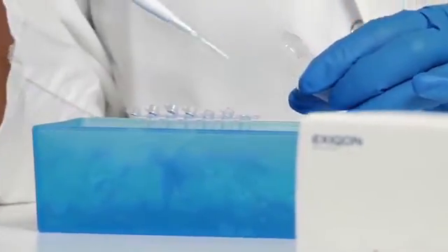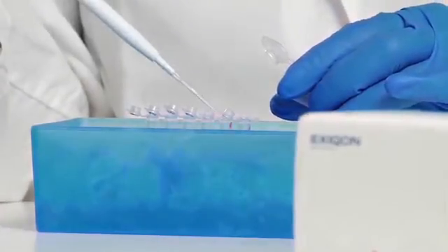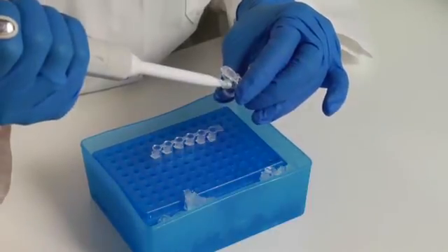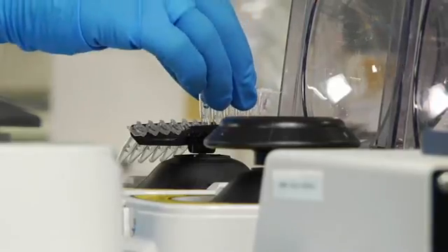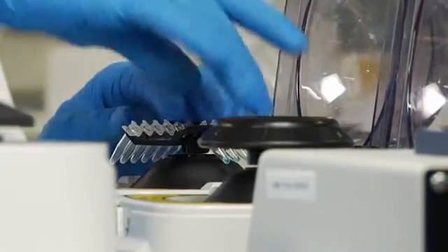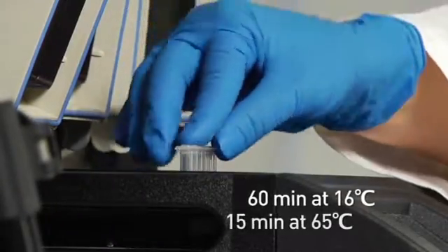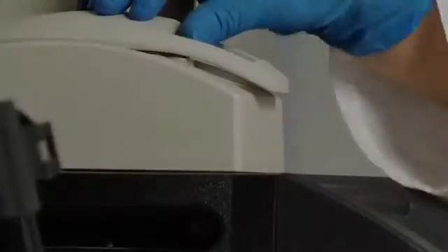During the incubation, prepare a master mix for the labeling reaction by mixing labeling buffer, DMSO, dye, and labeling enzyme. Add the master mix to the dephosphorylated samples, mix thoroughly, and then spin down the contents of the tubes. The samples are now ready for the actual labeling, the second part of the labeling reaction. Incubate the samples at 16 then 65 degrees in a thermocycler, then put the reaction on ice.